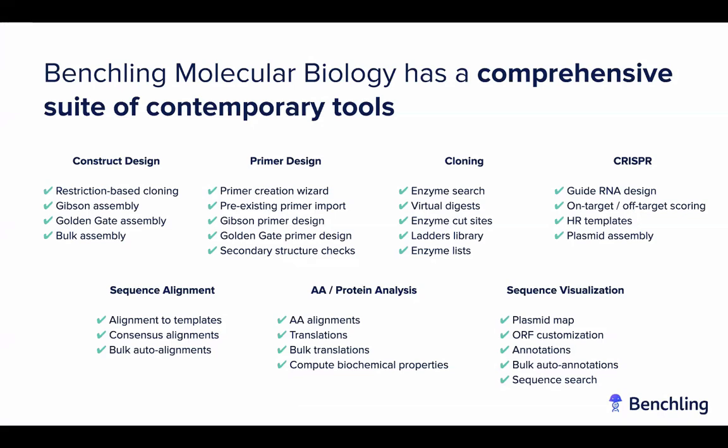We also allow you to bring in all of your primers and prior sequences from your DNA and proteins, because we know you're not starting from scratch. So to ensure you're actually using all the molecules and sequences that you already have in your lab. We were one of the first web-based tools for CRISPR, doing guide RNA design, on-target scoring, creation of HR templates, and putting those into plasmids.